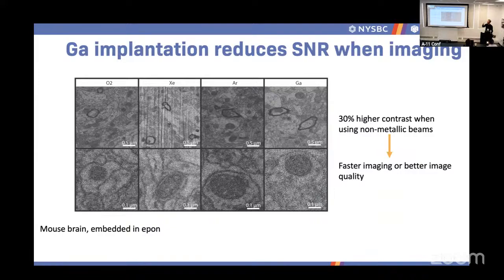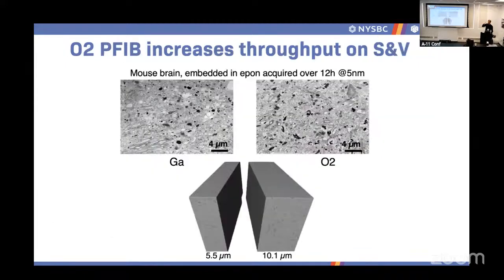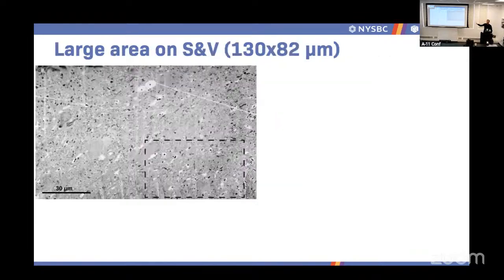and I know I shouldn't be saying this because I'm heading a cryo facility, but don't do cryo unless you really have to. Because if you are looking at a sample that looks like this, there's no way you can get that out of cryo. So do cryo only if you actually need resolution that goes sub 2 nanometers. Down to 2 nanometers, do plastic. Please do yourself a favor.